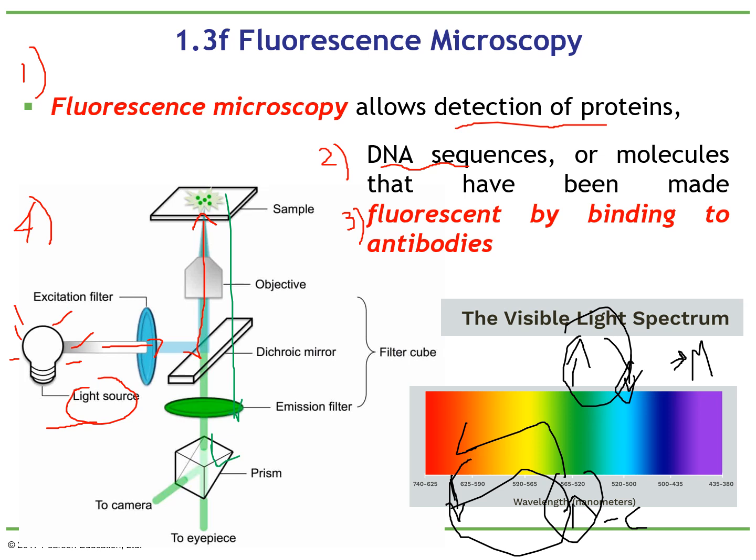Okay, so I hope that all this is clear. If not, you can watch the video again. And now I'm going to show you how these fluorescent probes work.